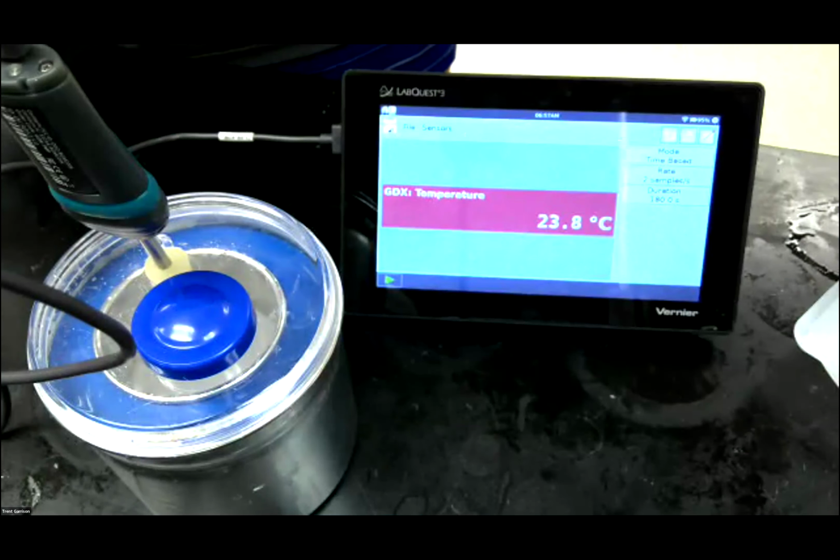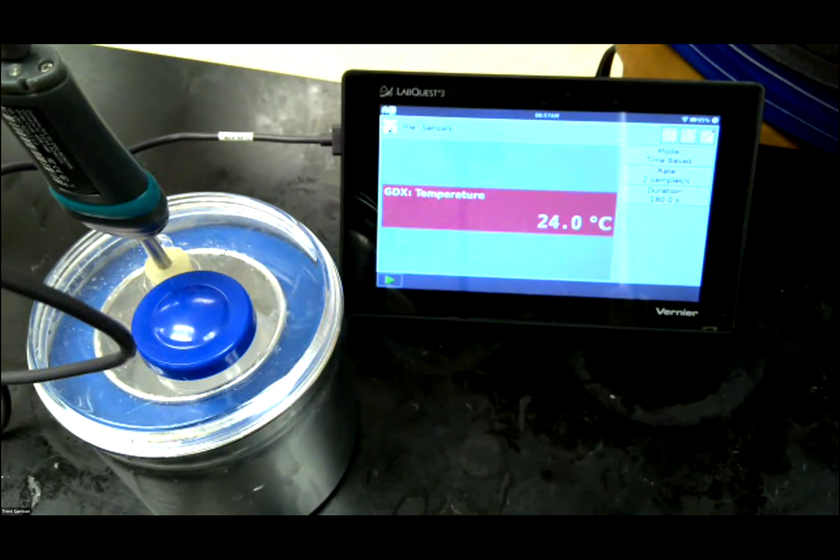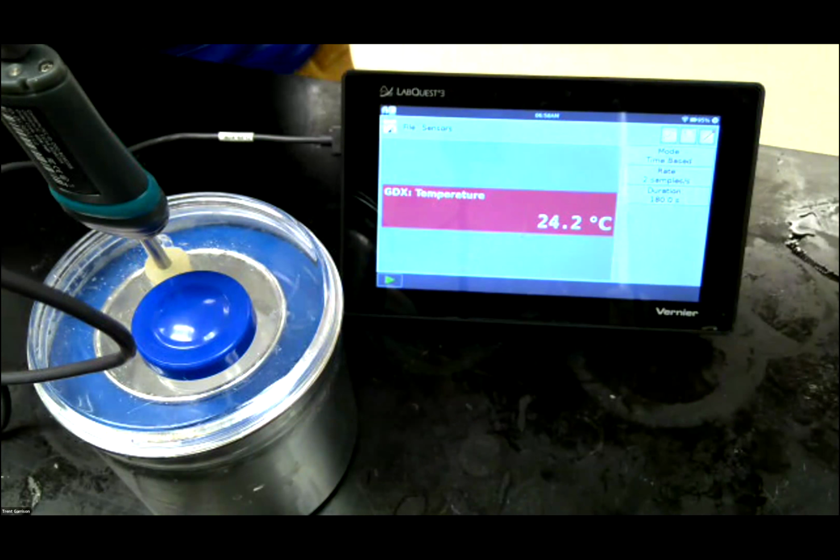All right, through time-lapse photography, we were at 24.0, and I just missed getting to the button. Oh, there it's going up. There it is, 24.0. Good. So that's going to be the maximum temperature. 24.1 it went up to. 24.2. All right. Does it look stable? It looks pretty stable. All right, so that's what we're going to go with, 24.2 as our maximum temperature on the first reaction. Okay, I'm going to pause the video, clean out my container here, and we will start on experiment 2.